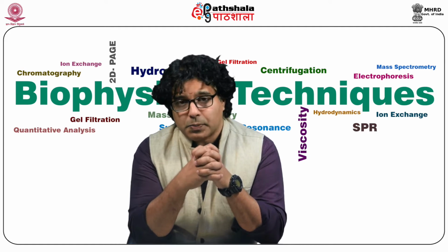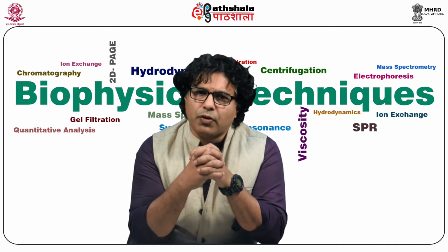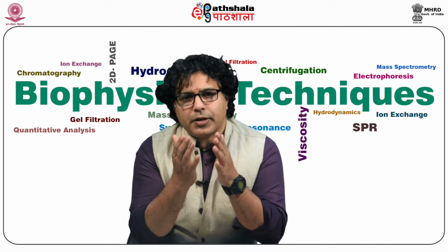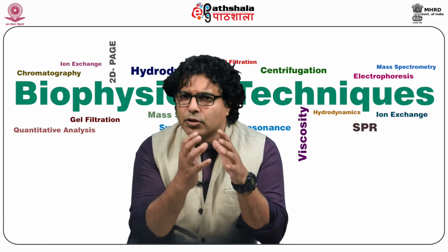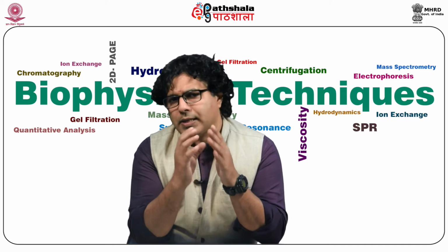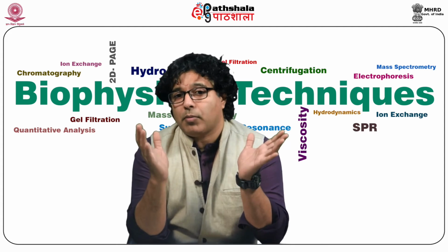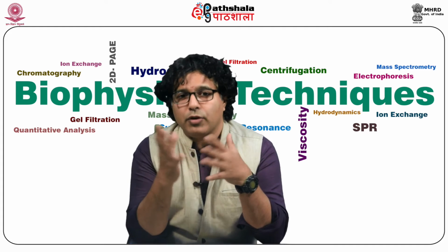Time-delayed fragmentation is another type of experiment, which we call MS to the power n. This is used for structural elucidation of a compound. This is subsequent fragmentation. You take a molecule and convert it to its protonated or deprotonated form, and bombard it with neutral molecules. Along with time, slowly you do this experiment. Stage by stage, you will see how the structure is collapsing, and this gives much information about its structure when you try to resolve the structure of an unknown compound. This helps us to identify new molecules.